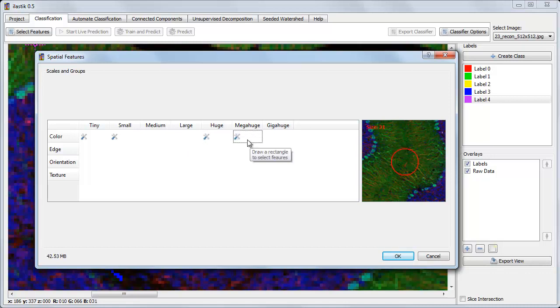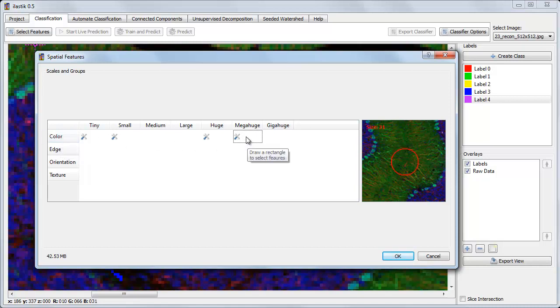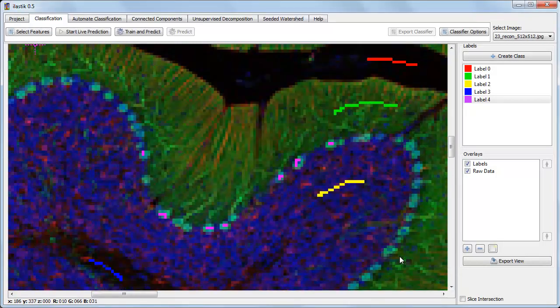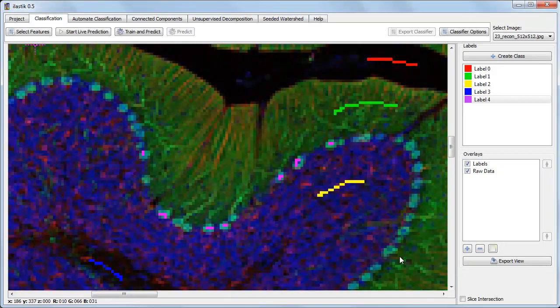Now I've selected one feature group at four different sizes, which means now there's four pieces of information available at each pixel. This is the information that's provided to the classifier. Let's see if we've provided it with enough information to correctly label the other pixels.